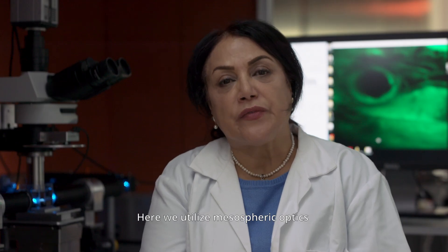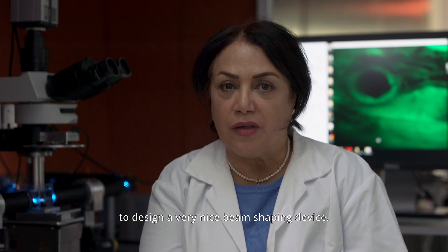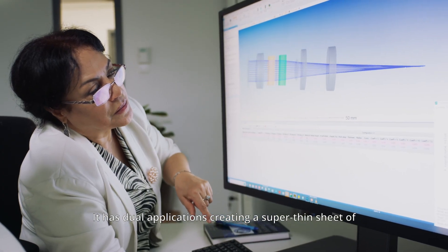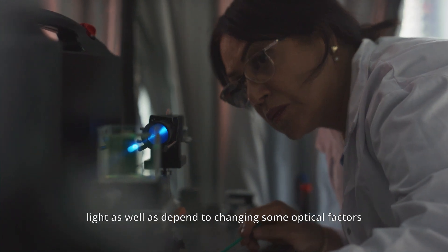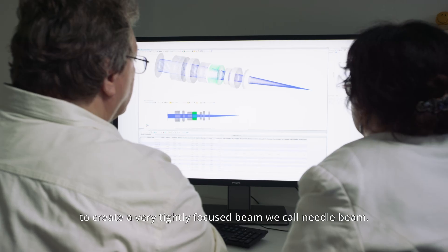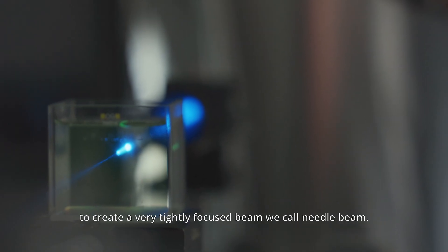Here we utilize mesospheric optics with a special conic factor to design a very nice beam shaping device. It has dual applications: creating a super thin sheet of light, as well as, by changing some optical factors, creating a very tightly focused beam we call a needle beam.